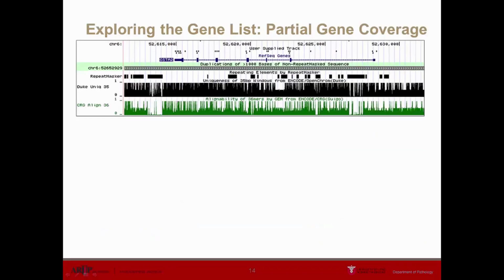And then, like I said, we wanted to make sure that we had a set of validated probes covering the exons at the exonic level. So for us, it was important that 70% of the exons in any given gene be covered with 4 or more probes. And not all genes were.